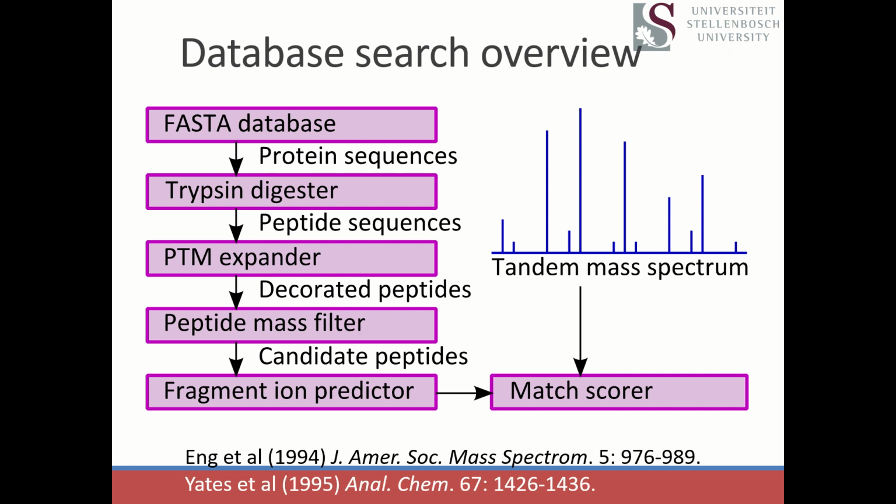How would we decide which peptide sequences should be compared to tandem mass spectra? Precursor mass, exactly. It's right there in the diagram. So we didn't measure just fragment ions for these peptides. We also measured precursor masses. So typically we have a high resolution MS scan that shows us to a very, very small degree of error what the mass to charge value of the ion is. And if we saw multiple isotopes for it, well then we can probably infer its charge, thus making it possible to just infer its mass directly.